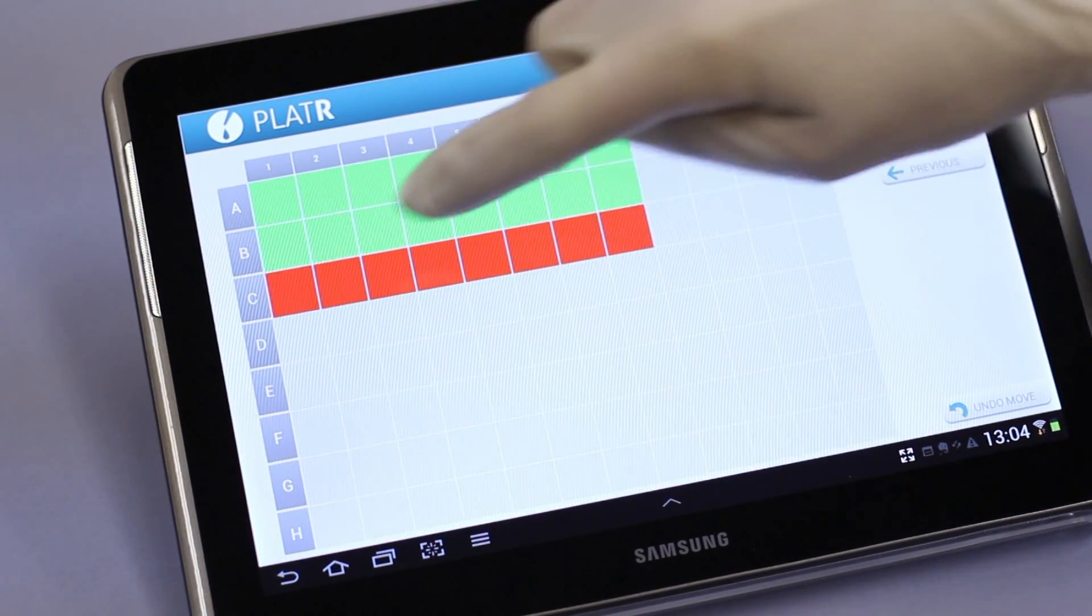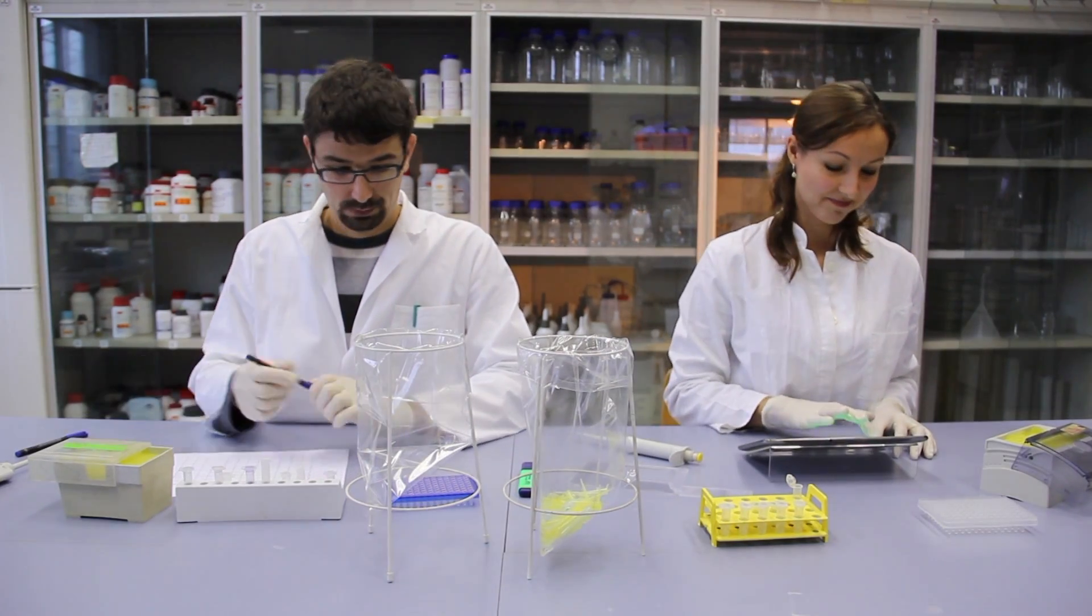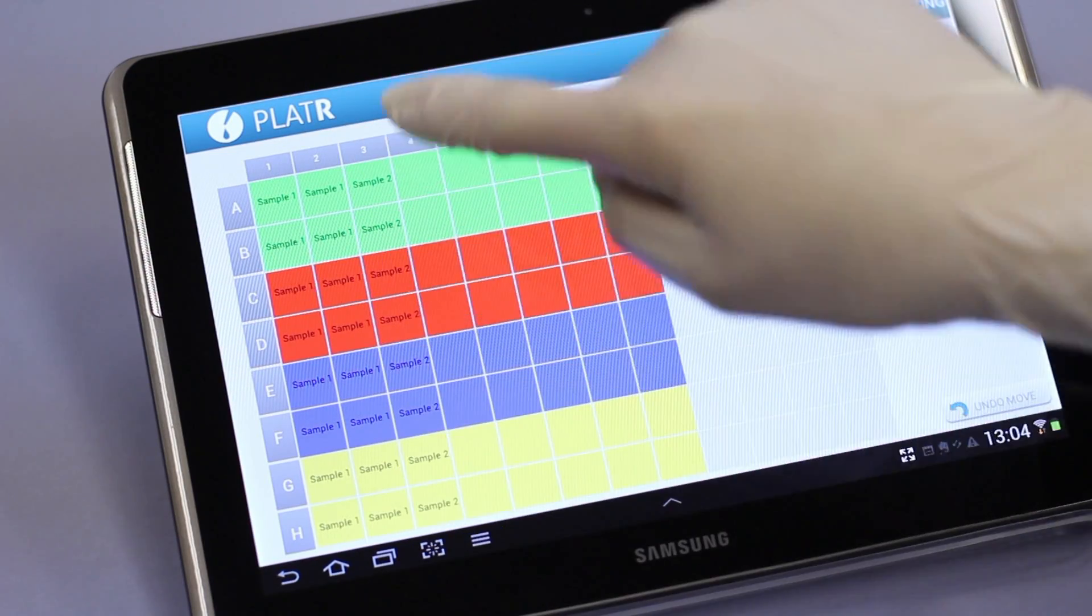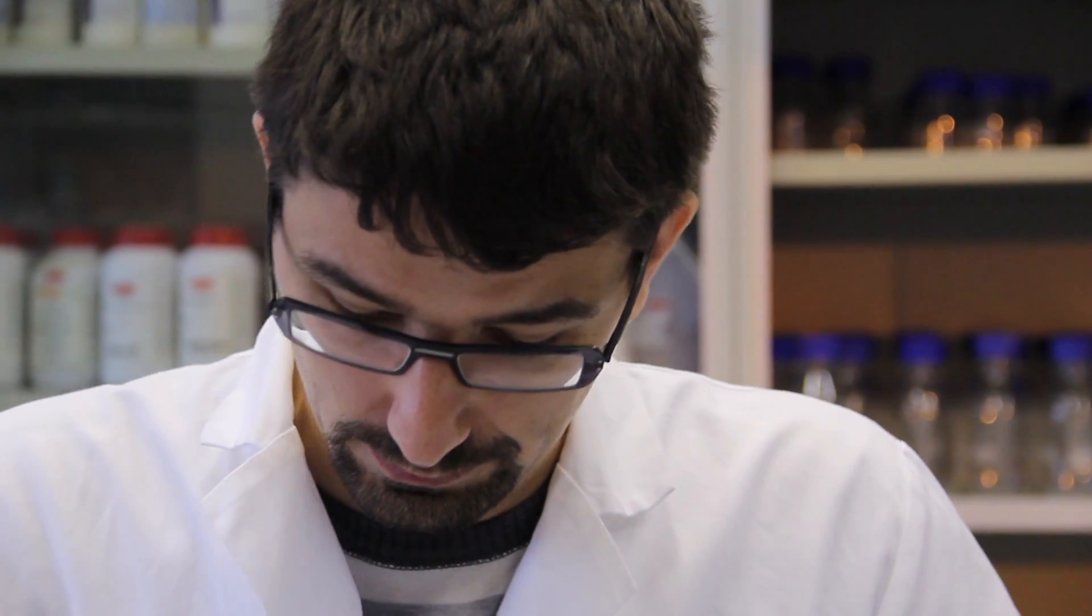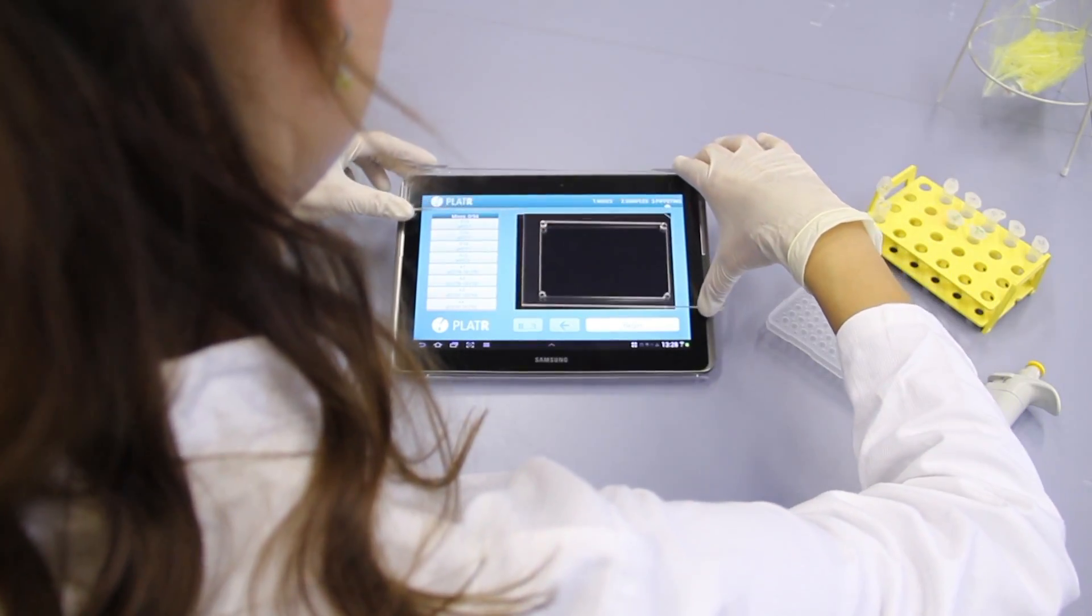Create your pipetting plan using simple swipe motions. It's fast and easy. After organizing your reagents on the plate, simply distribute your samples and Platter will record these motions and transfer them into a pipetting plan. Now you're immediately ready for pipetting.